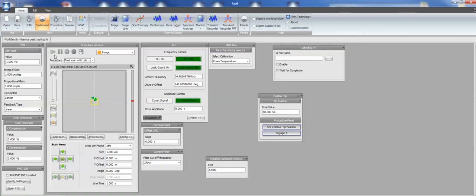So hopefully this was a nice quick introduction for you for how you can call VIs and executables from the R9 software in procedure space.